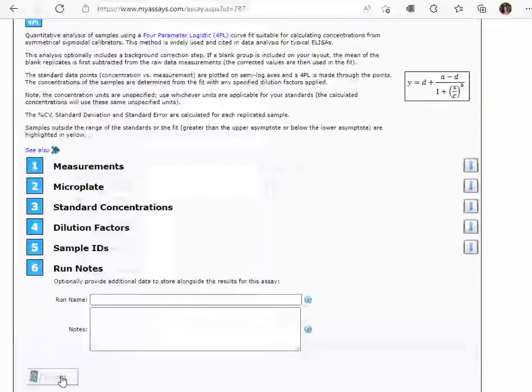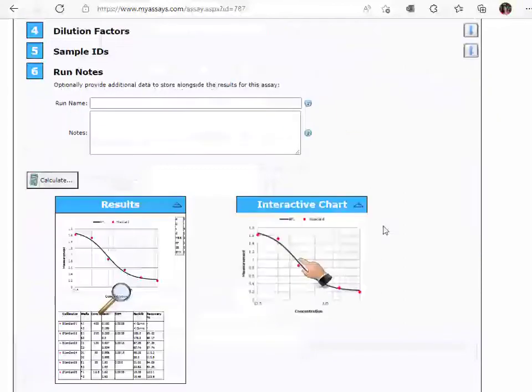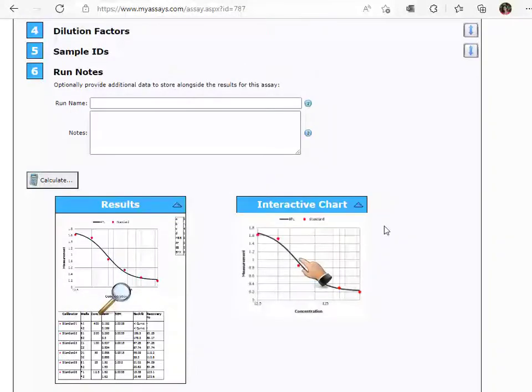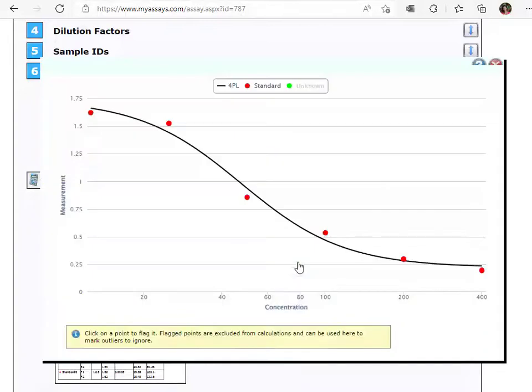By pressing Calculate, the curve fit is performed and results are calculated. Clicking the interactive chart allows you to optionally flag and remove points as well as add other sample types to the curve.